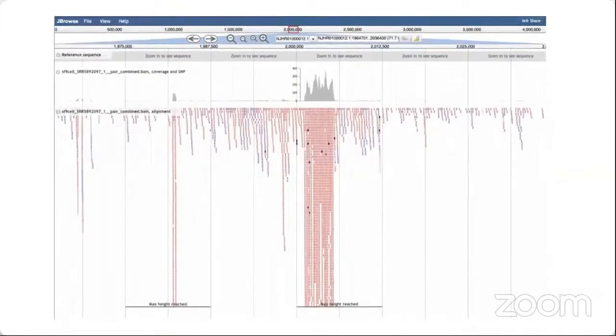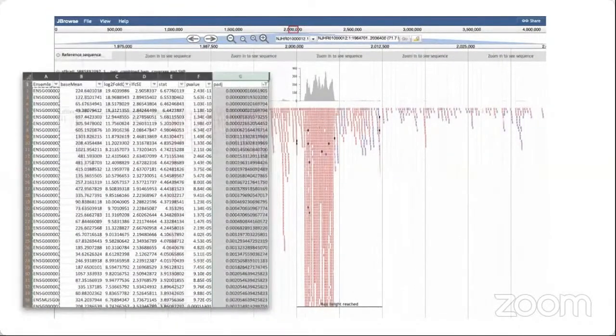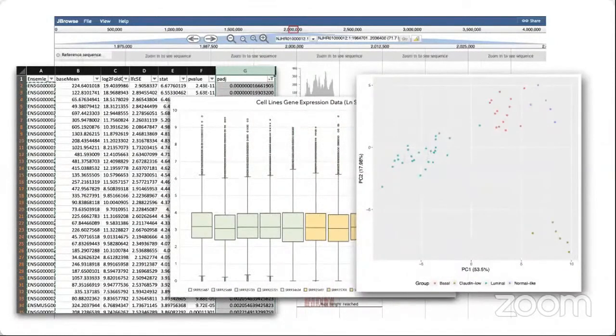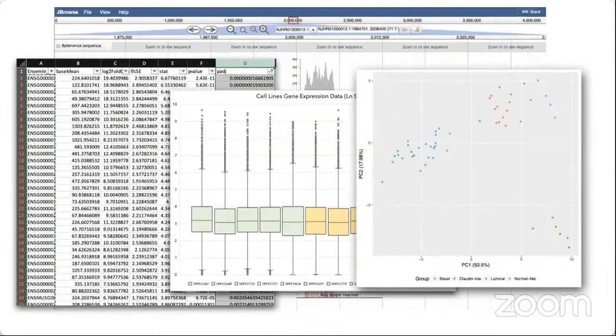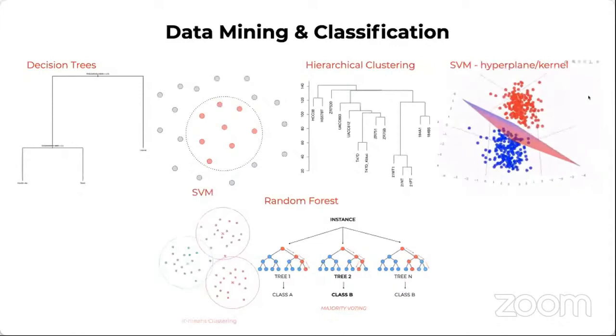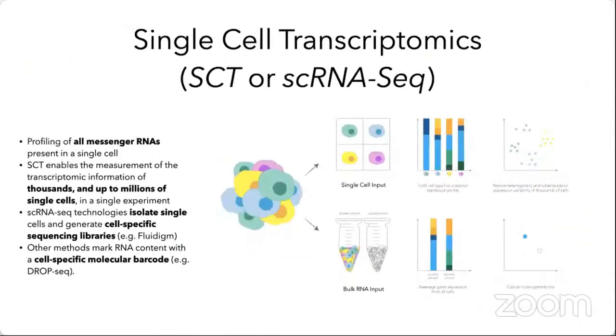You will get a variety of outputs, which will include tables, plots, and also interactive visual outputs. All of this will help you understand the biological phenomena or clinical condition of the disease. As I mentioned, this structured data can be used for further data science based analysis.